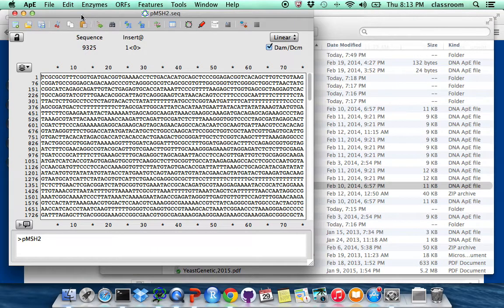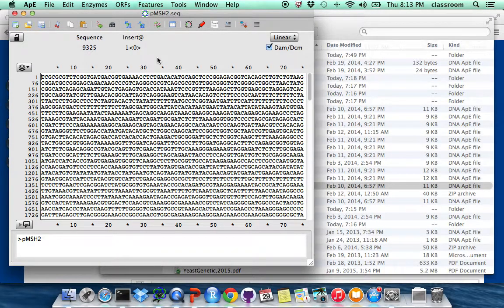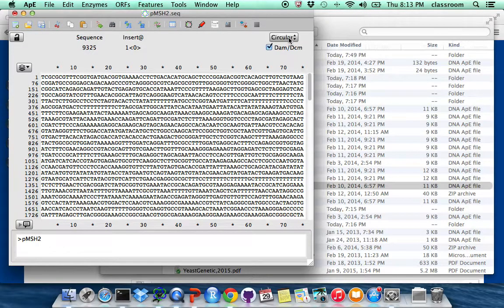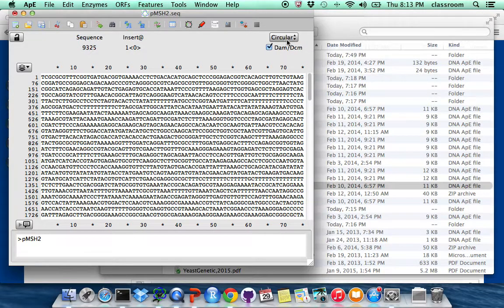So this is plasmid DNA carrying the wild type MSH2 gene. This is plasmid DNA, so this should be circular. Make sure this is circular.